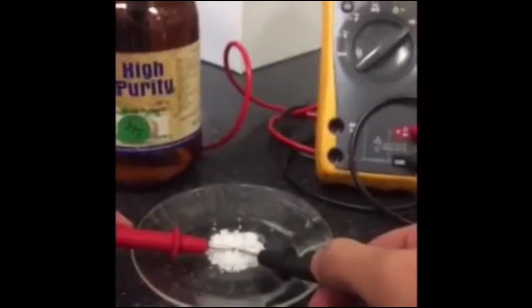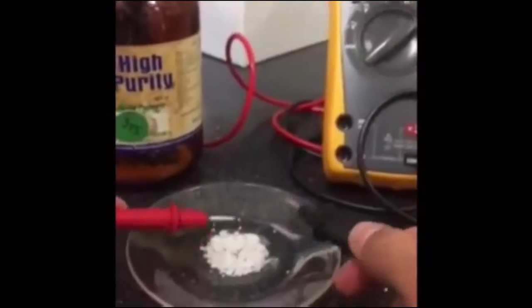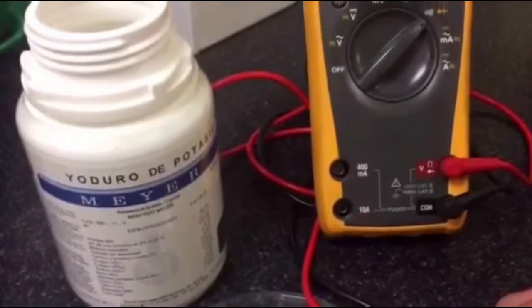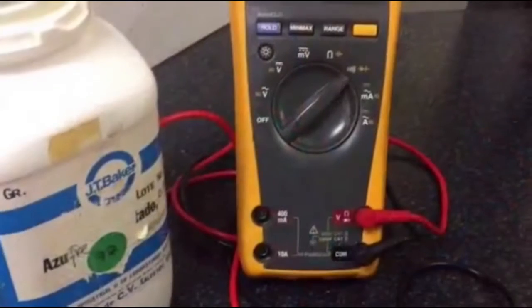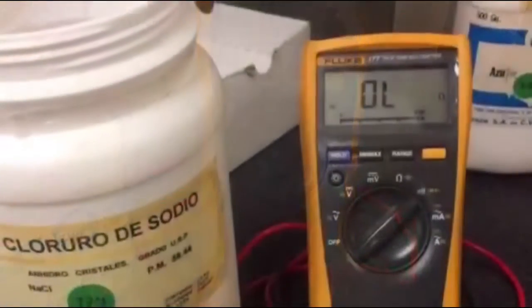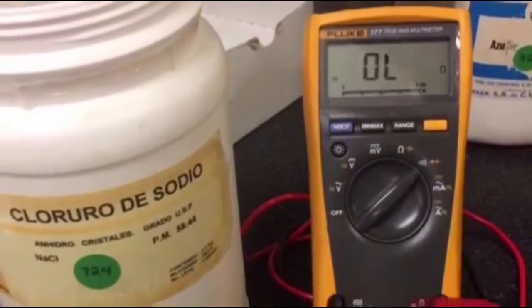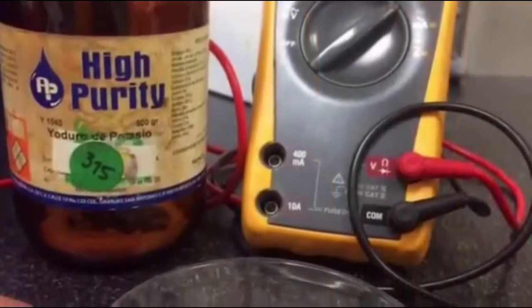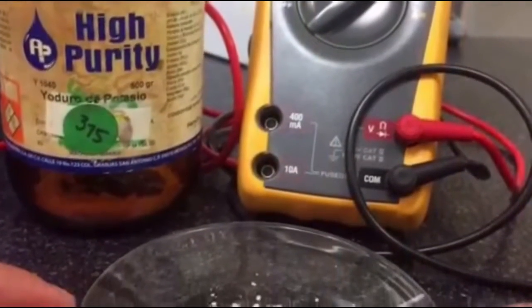In this practice, we add to test tubes solid and liquid compounds. Then we add water or benzene. Then we measure the conductivity of the compounds with the use of a multimeter. We measure if they conduct electricity or not.